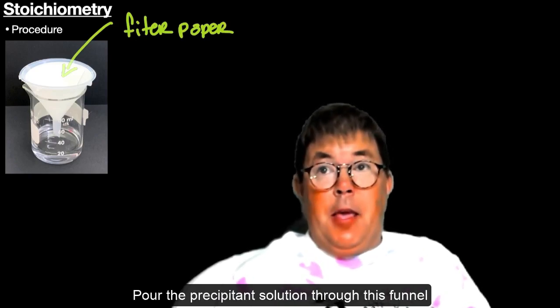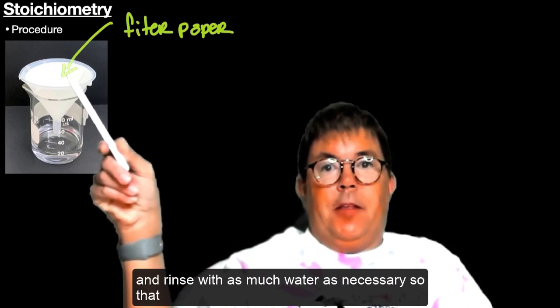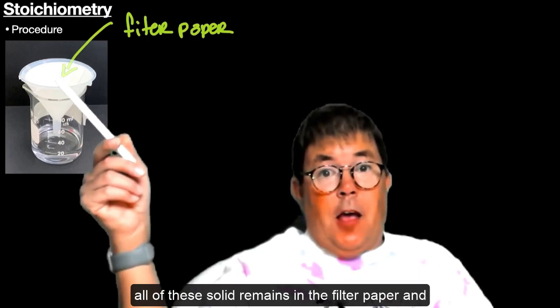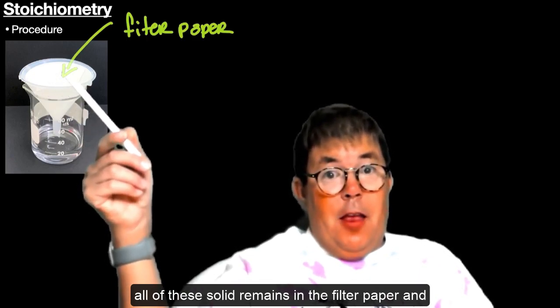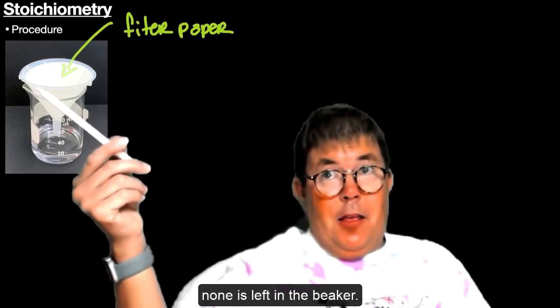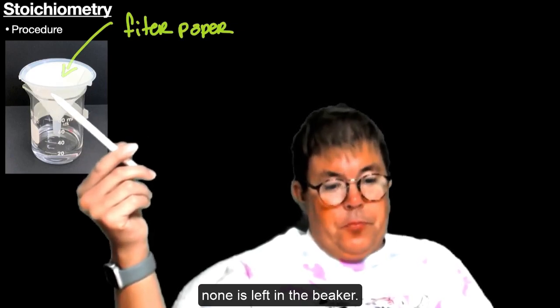Pour the precipitate solution through this funnel and rinse with as much water as necessary so that all of the solid remains in the filter paper and none is left in the beaker.